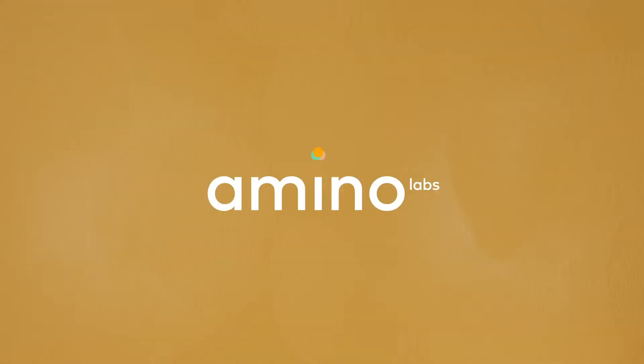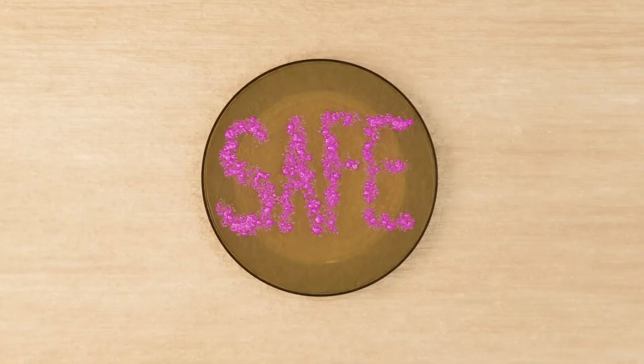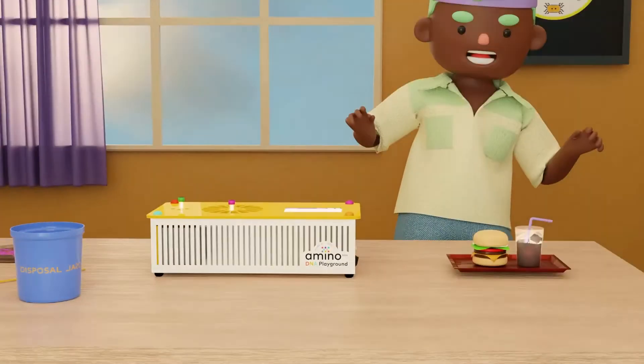Practice safe science with Amino. Genetic engineering and life sciences are safe activities when you follow these simple guidelines.